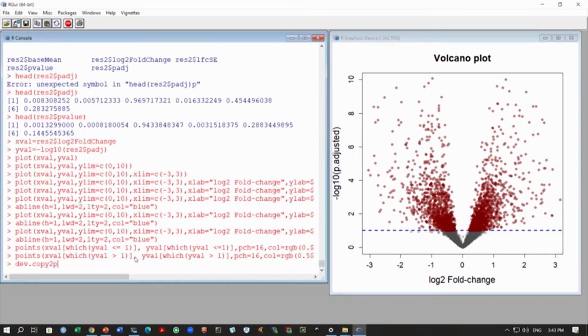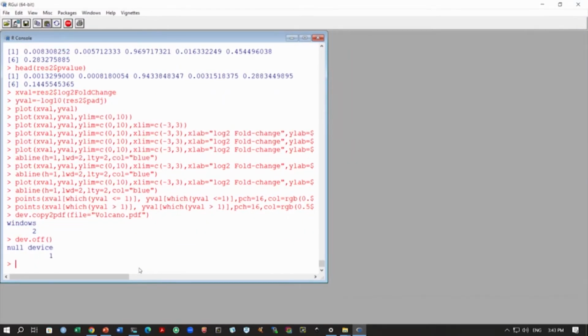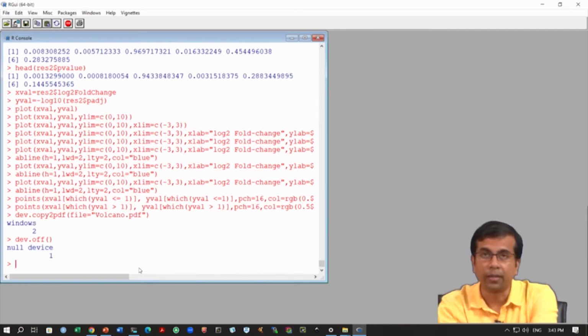We have talked about how you can save this in R in PDF format. We prefer the PDF format because of its resolution. It will maintain the resolution, otherwise if you export in JPEG or BMP you would lose resolution. So, you can simply save this using dev.copy to PDF, right. So, this output will be copied and then switched off. Okay. So, this part is done, right.